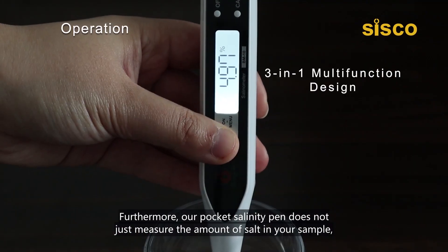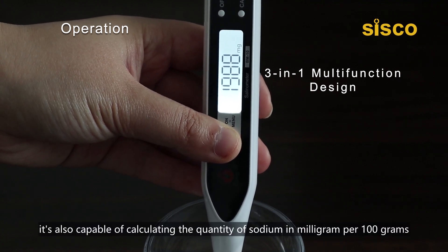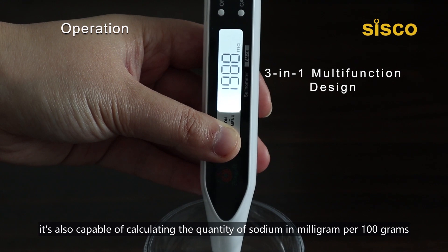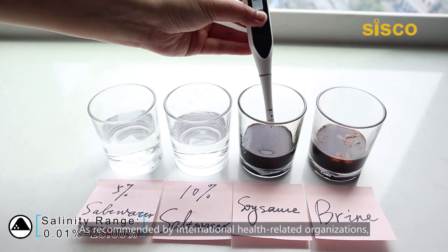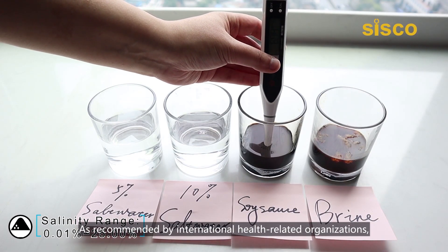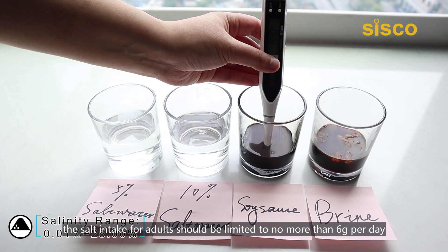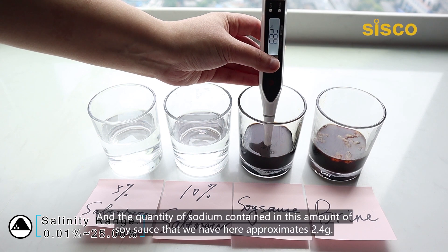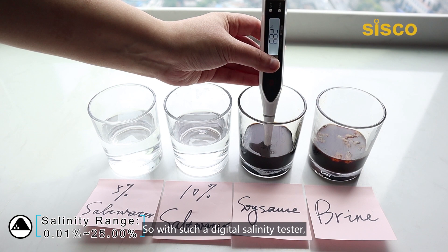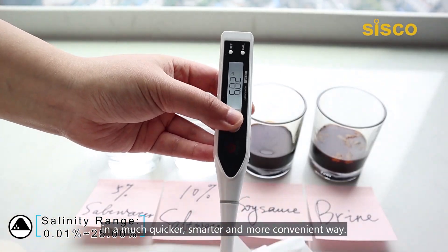Furthermore, our pocket salinity pen does not just measure the amount of salt in your sample. It's also capable of calculating the quantity of sodium in mg per 100 grams to give you an intuitive insight into how much sodium you're about to take in for a day. As recommended by international health-related organizations, the salt intake for adults should be limited to no more than 6 grams per day — that's equal to 2.4 grams of sodium per day. And the quantity of sodium contained in this amount of soy sauce that we have here approximates 2.4 grams. So with such a digital salinity tester, you can get your daily salt intake well in hand in a much quicker, smarter, and more convenient way.